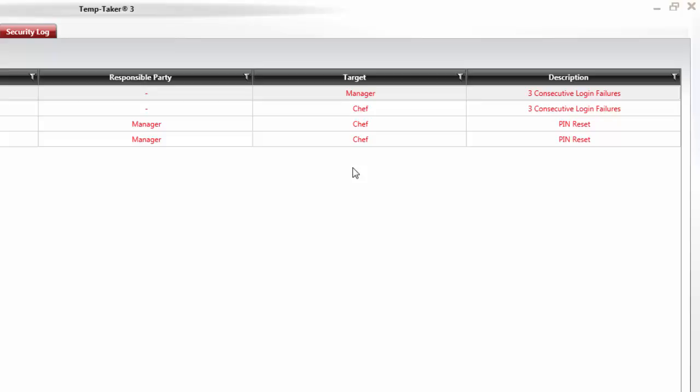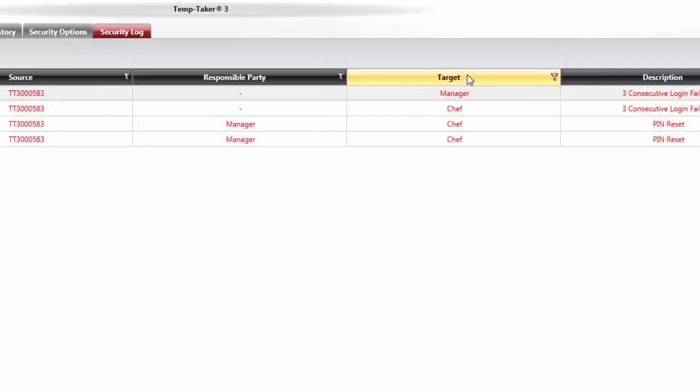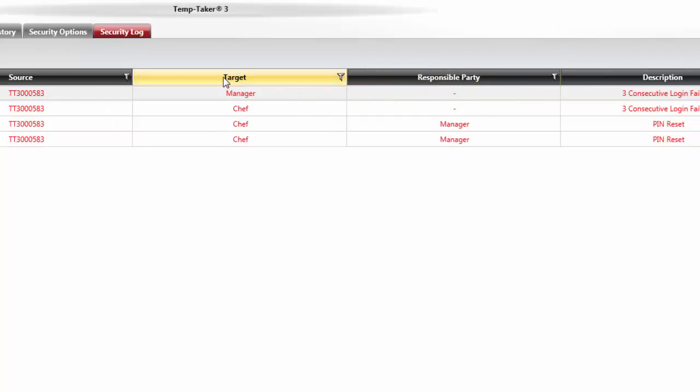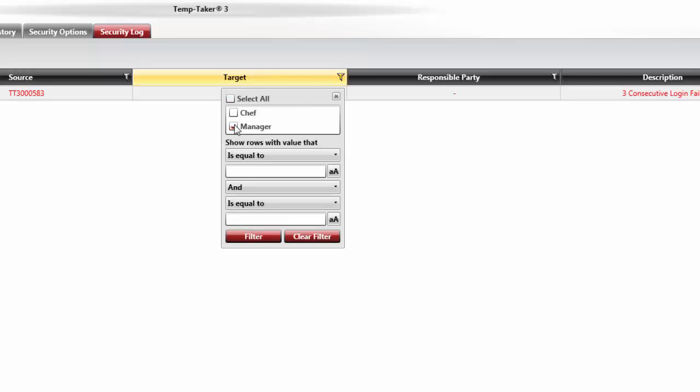Columns can also be rearranged in left and right directions by clicking and holding your mouse pointer in the center of a given column's title bar and then shifting the column in the direction of your choice. Once satisfied, release the mouse button to permanently place the column in your new location. Lastly, each column displays a small silver-colored funnel icon positioned to the right of each column's title bar. These are called filters, and when clicked upon, they allow you to focus in on only the data you wish to sort through within that column, eliminating clutter and shortening longer lists of information.